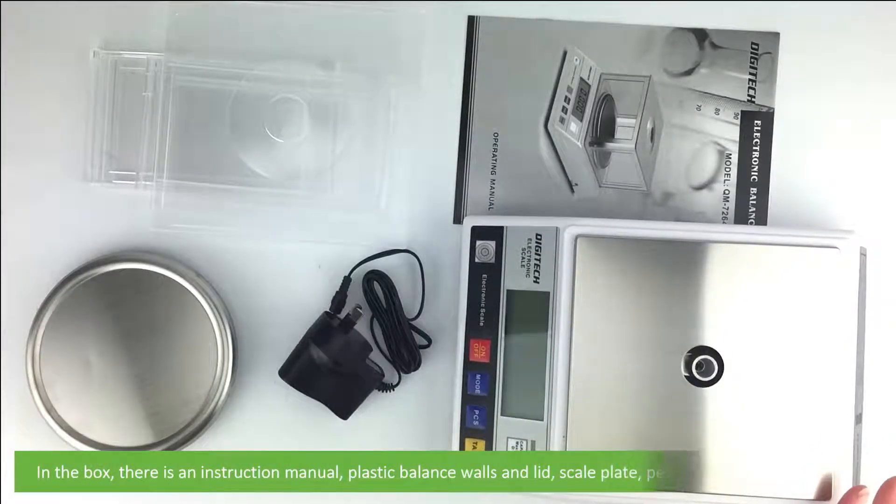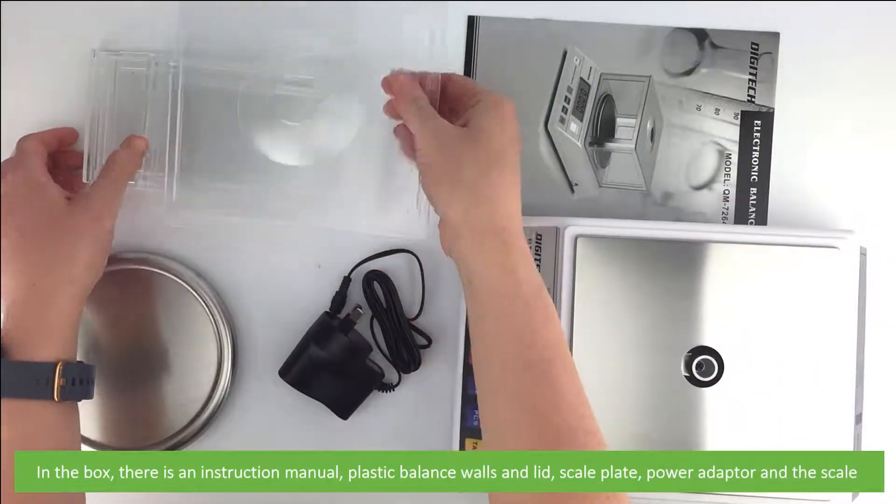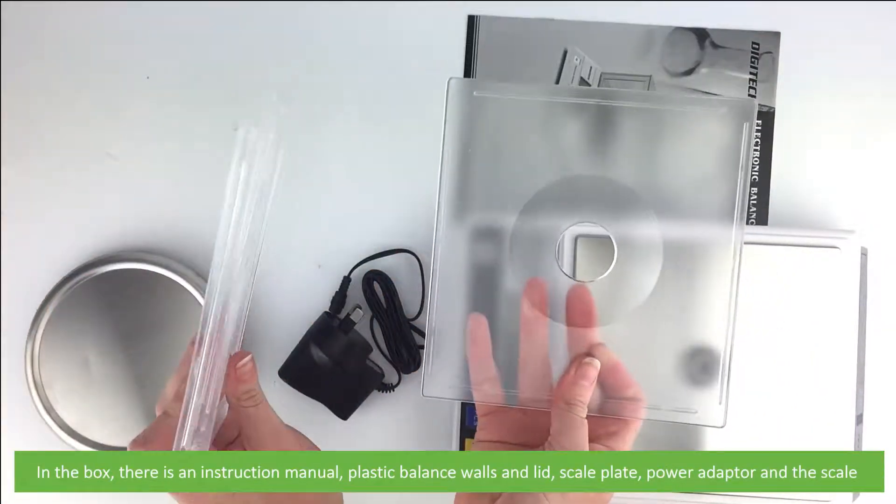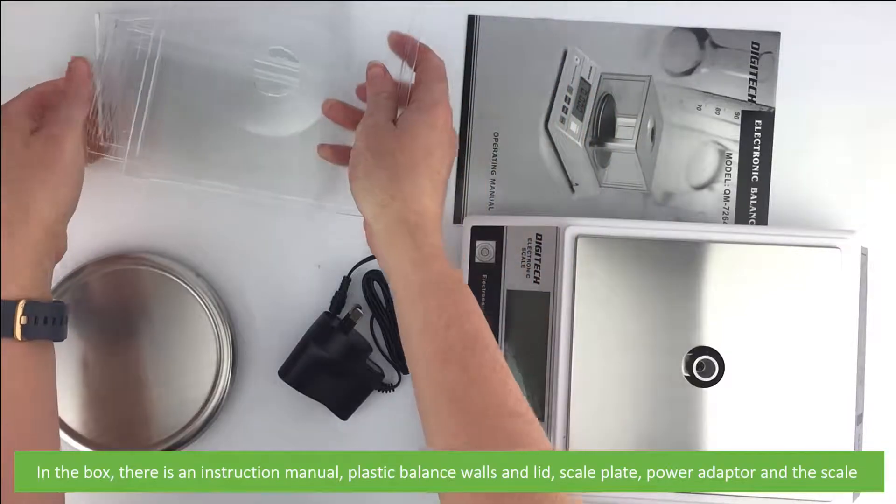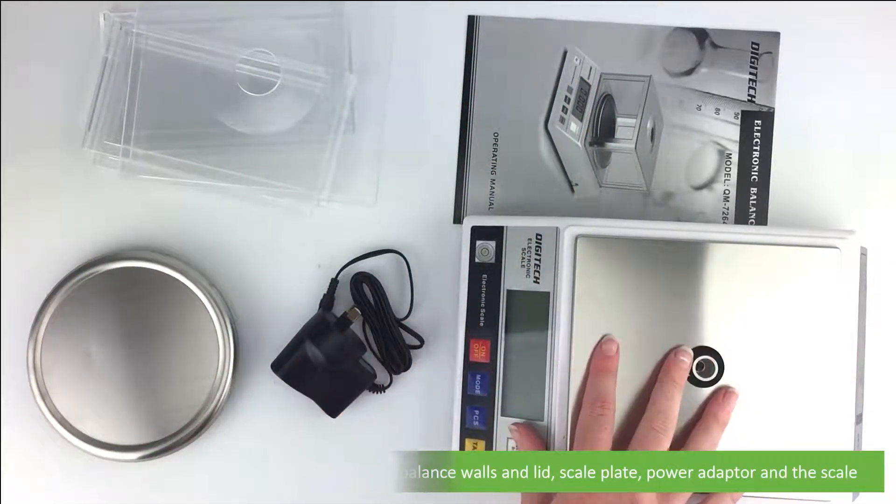In the box, there is an instruction manual, plastic balance walls and a lid, scale plate, power adapter, and the scale.